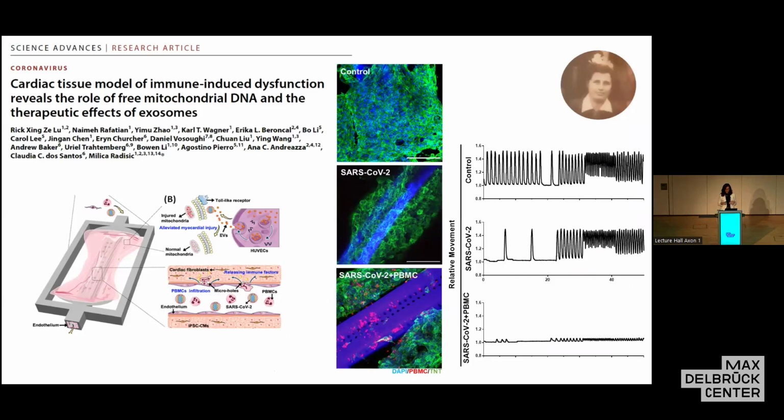So she was immunized. She was also 89 after she got COVID. COVID went away, but she got heart failure and she unfortunately died. And there are quite a few patients who had the same experience. So what we did here, we built the heart tissue around this AngioTube invade platform.